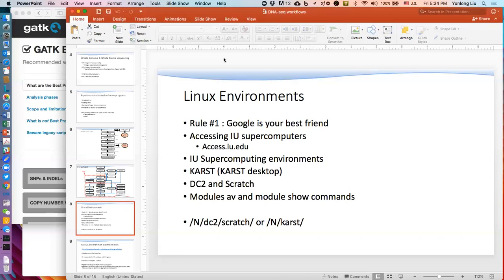And this will take time. If you remember, I pointed out to you the run times for whole exome and whole genome sequencing. That's to generate the entire thing through a VCF. You're going to want to give yourself time to learn the software and get through the alignment systems at BWA. So please make sure that you're available, that you have access to everything.